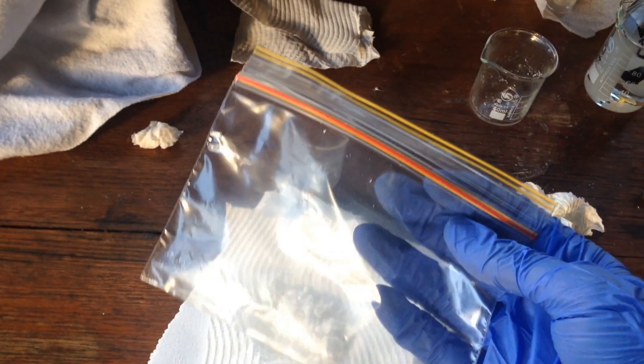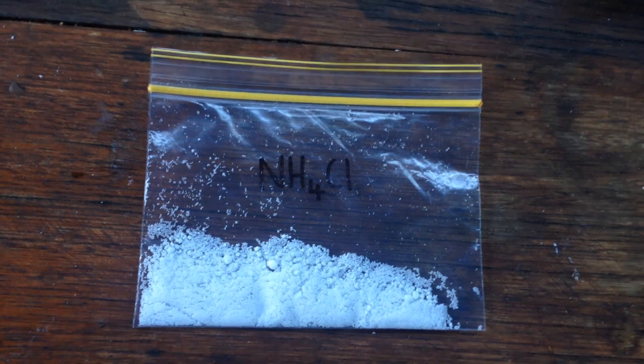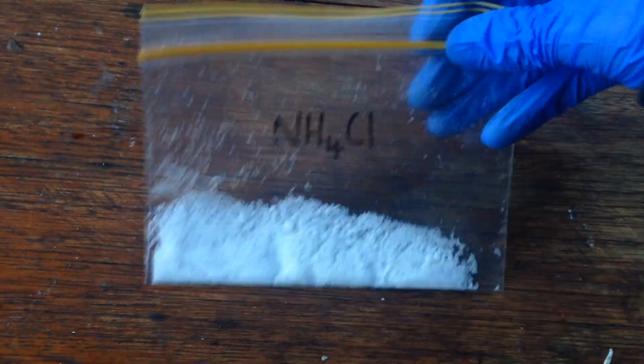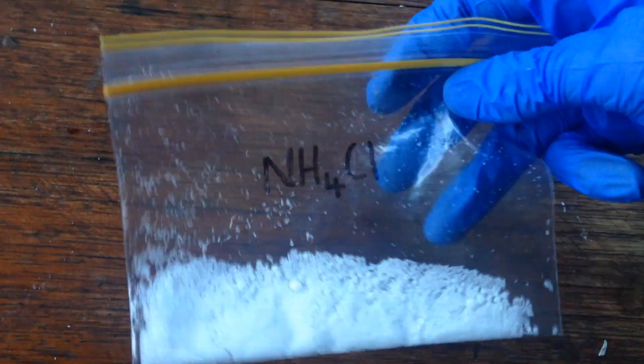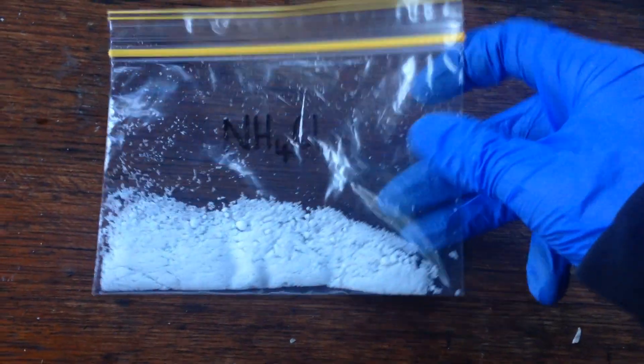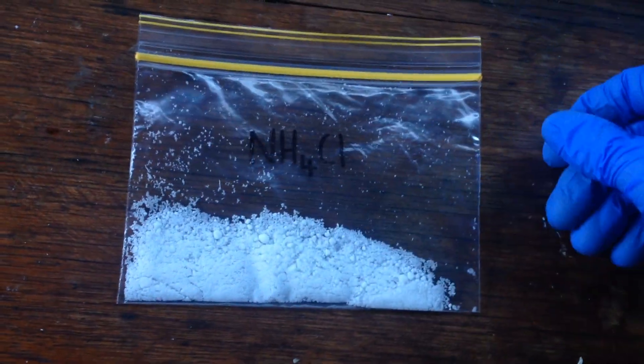I'll just transfer it to this ziplock bag and we'll be done. I'm not actually going to use this stuff — I've made it for my grandmother so she can do some wood burning art or something. But anyway, there's our yield — probably around five grams, like we calculated initially. Catch you next time.